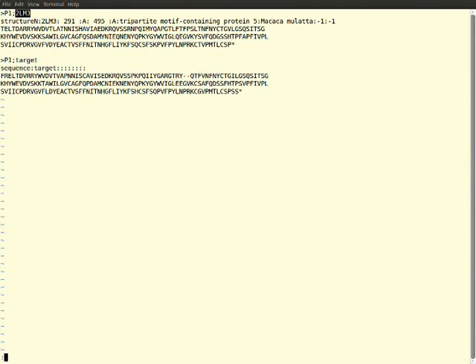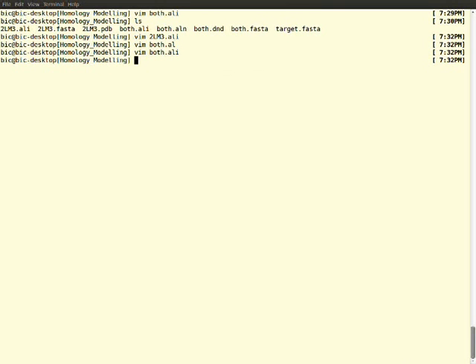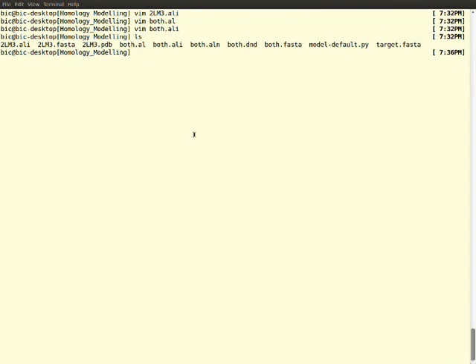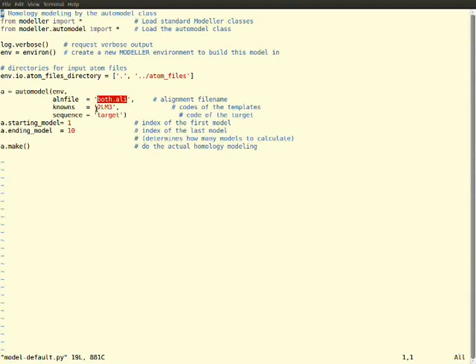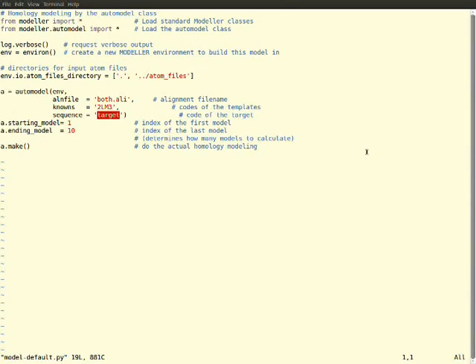Before going into homology modeling, we want to know about one more input file called model-default.py file, that is a Python file which is going to run our program indicating our inputs. The things which you want to edit in this Python file: give the alignment file name - our alignment file name is both.ali. You should write the codes of your PDB. You should be very careful what code has been mentioned in your PDB file. The similar codes should be given in this quotes. You should give the code which you written for your sequence. The code which I written for my sequence is target, so I have given the name target in this quotes. This is optional - how many models you want to generate. It's obvious to give one to ten to generate models, so that we can visualize among them which is the best model.